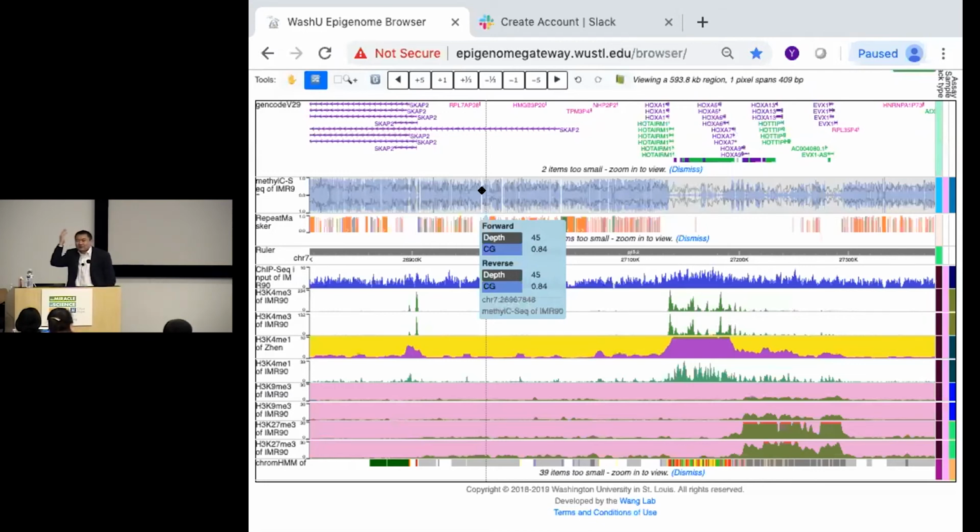So, maybe it's not a big deal, but it is a big deal. You're not showing your real data. The data contains more information. So how do you deal with it? It's actually very simple. In our hands, it's very simple.